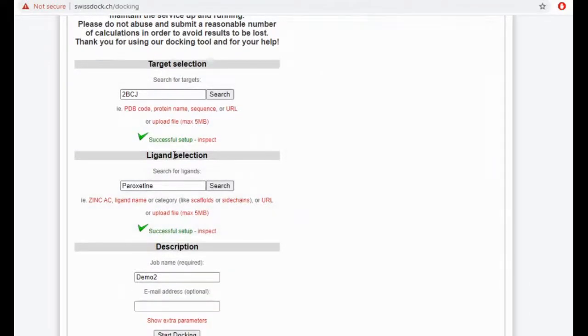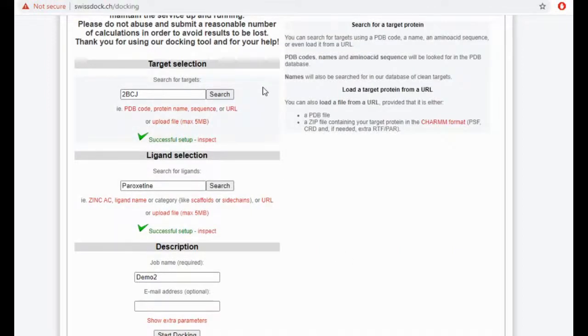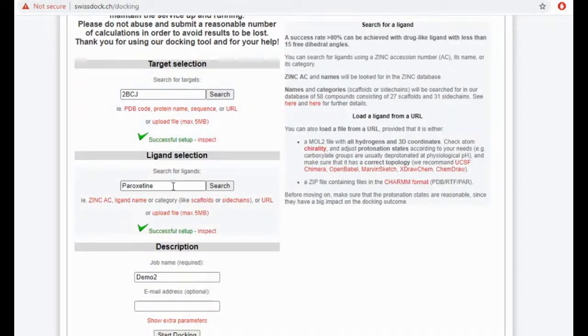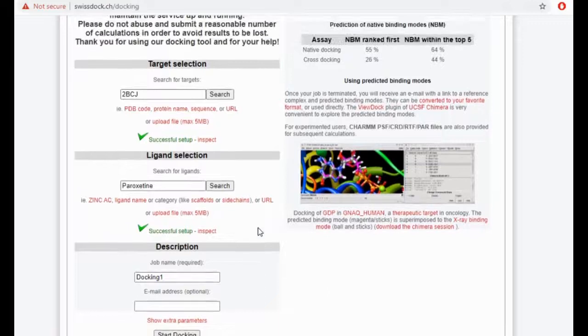Then you have paroxetine, which is your ligand selection. Both of them — the similar thing — you click on Search, and it takes you to another window where you can select the chain for 2BCJ and the ligand, or the structure for paroxetine. Then you can select the job description — our job description was 'docking one' — so you click on 'Docking One'.